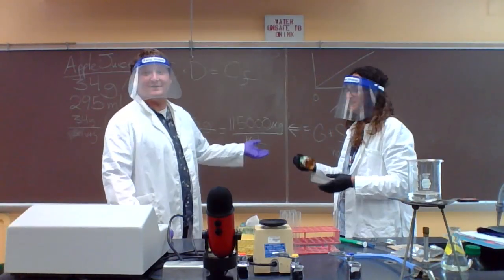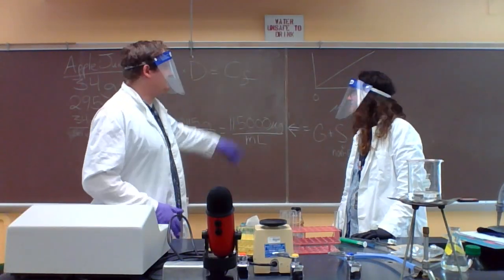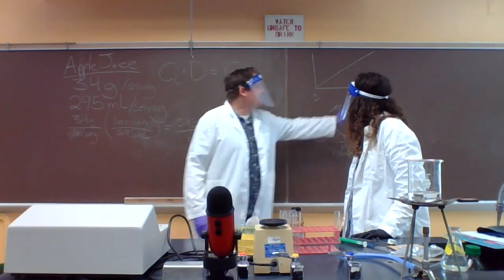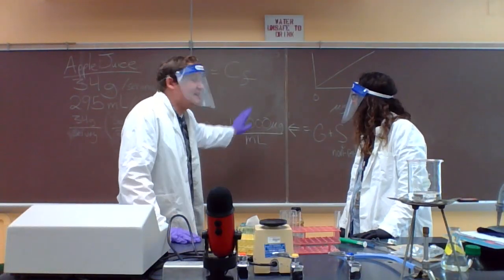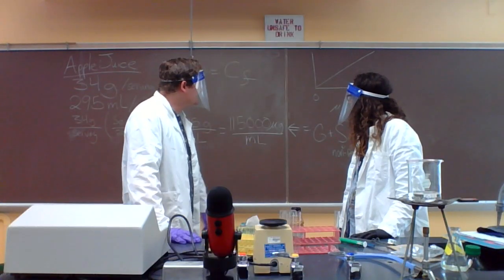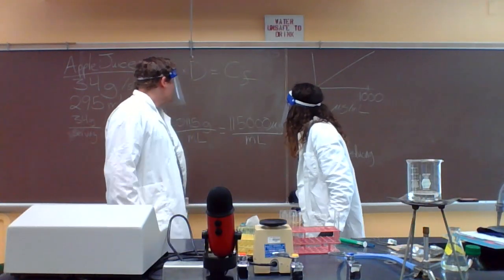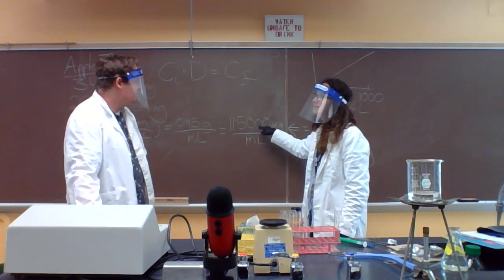And that's a key point, right? When we're using a standard curve, we can only trust values that fall between our minimum and maximum known values of concentration. We can't extrapolate all the way out to higher concentrations. So if we did a 1 in 10 dilution, it would still be too high.